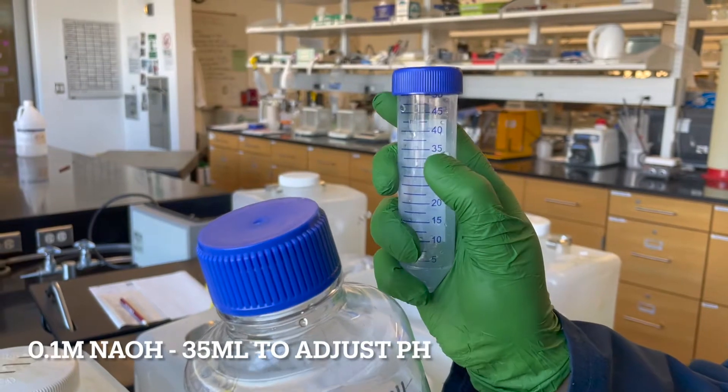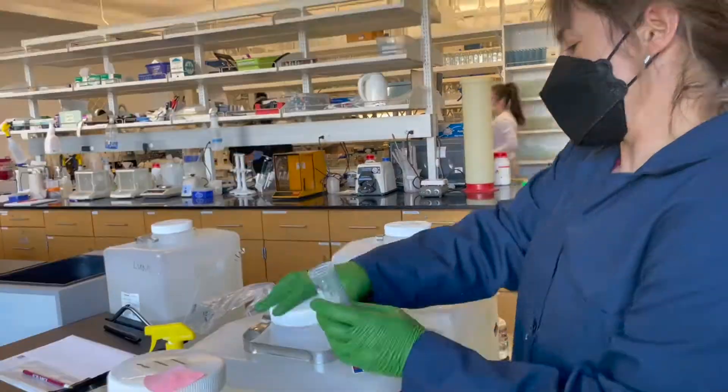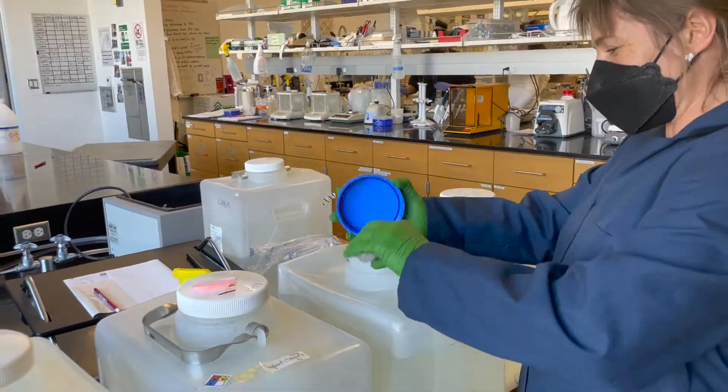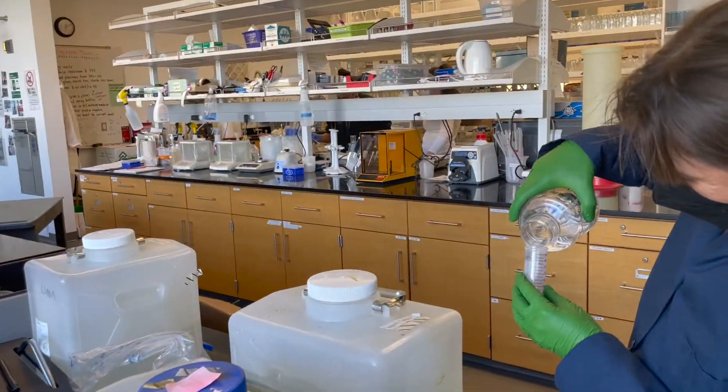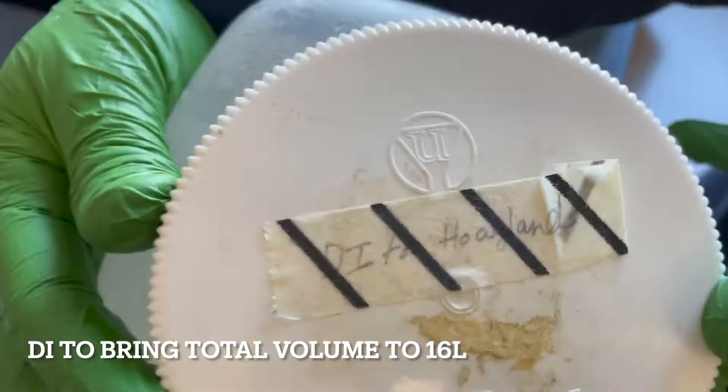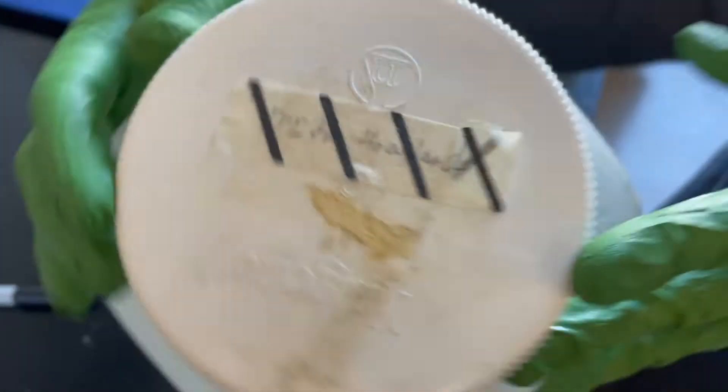Once you've added all the ingredients, it's important to adjust the pH. Hoagland's solution requires a pH range between 5.6 to 6. After all the ingredients are added, remember that you need to bring the total volume to 16 liters with DI water.